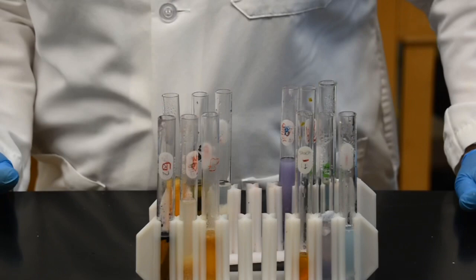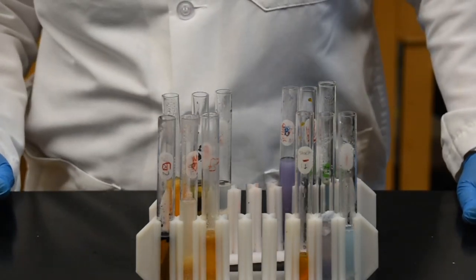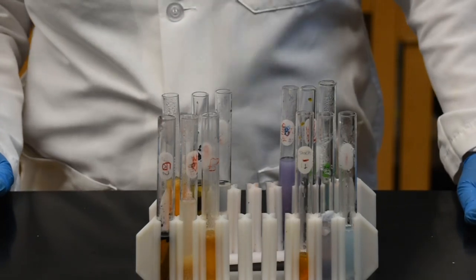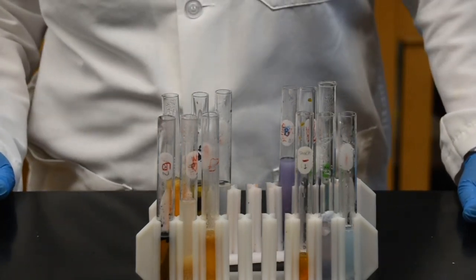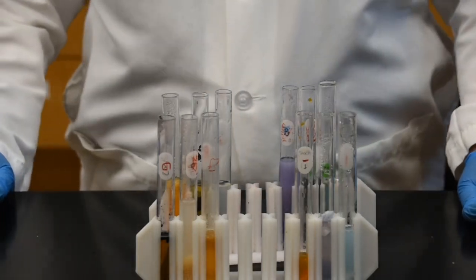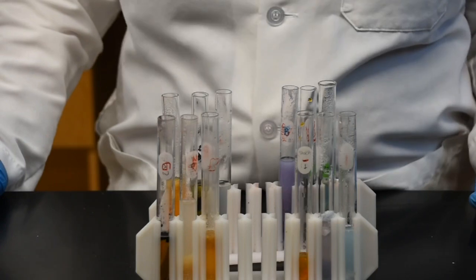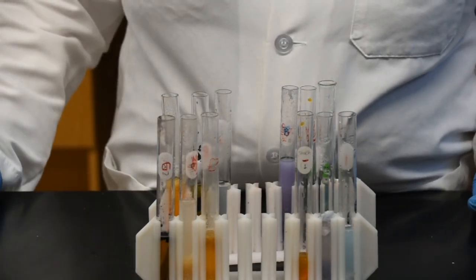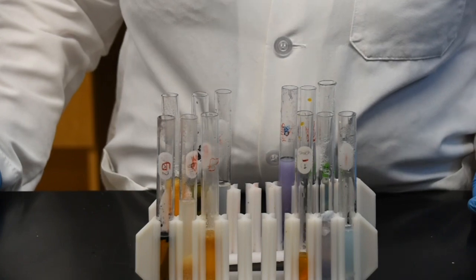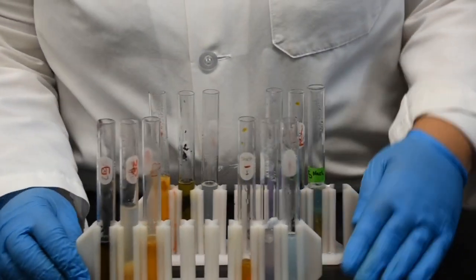So based on the results you guys now have, you guys are going to complete your second table. The second table is asking you to basically put a plus or minus for the tests that are positive. Put plus for the positive, and if the indicator did not change color, that means that was a negative test.